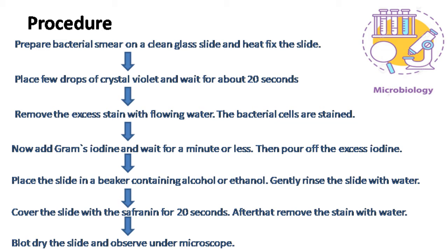Add the gram's iodine and wait for a minute. Then pour off the excess iodine and place the slide in a beaker containing alcohol or ethyl alcohol. Now gently rinse the slide with water and cover the slide with the safranin for 20 seconds. After that, remove the stain with water, blot dry the slide and observe under the microscope.